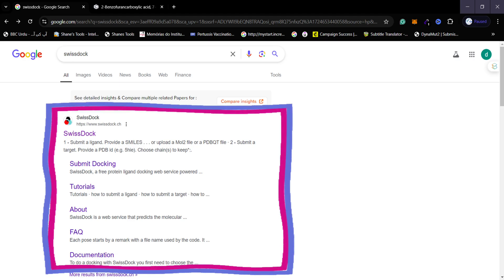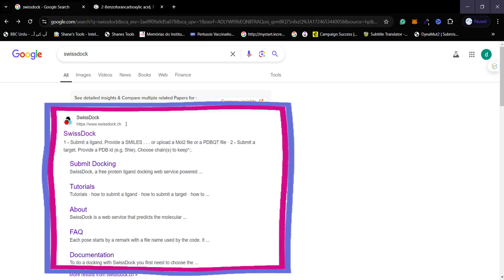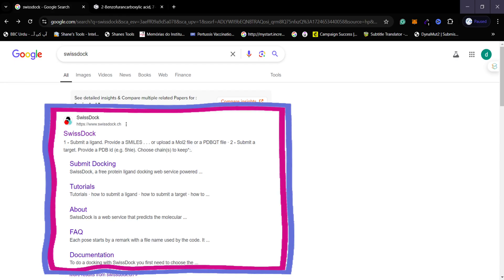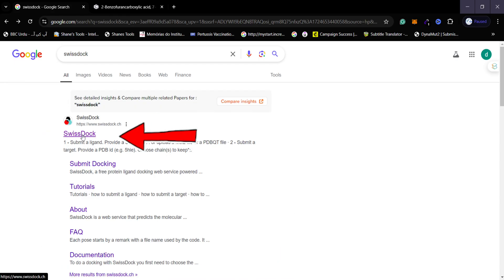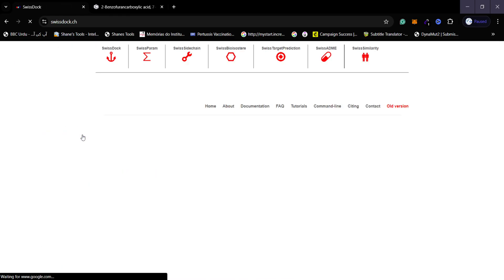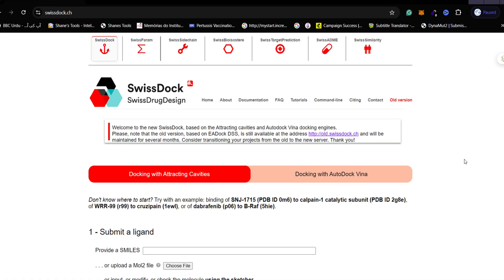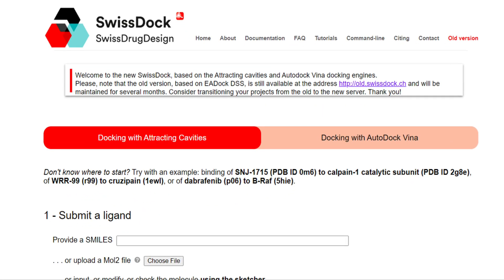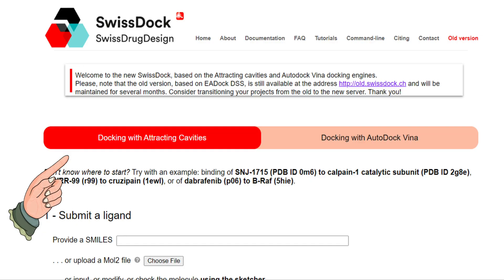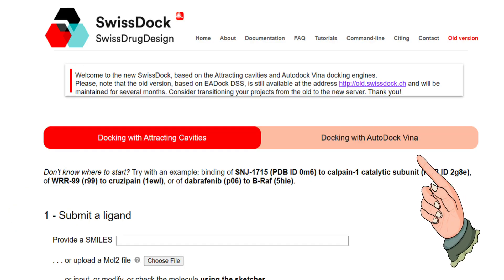To access SwissDock, just search for 'SwissDock' on Google and the first website will appear. Click on the link and the SwissDock interface will open. On this interface you will find two different options: the first is docking with Attracting Cavities, while the second is docking with AutoDock Vina. We are interested in docking with AutoDock Vina, so we will select that option.